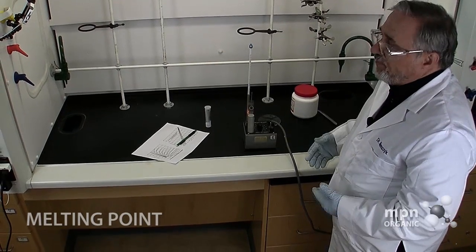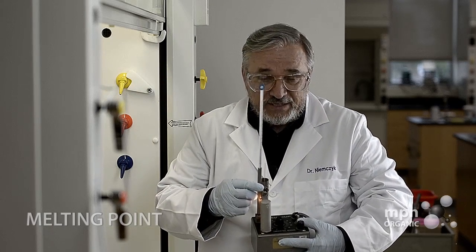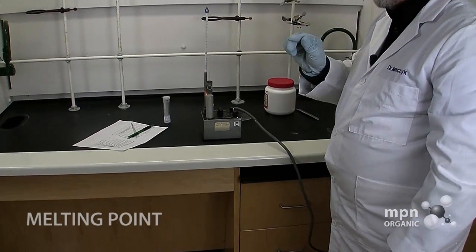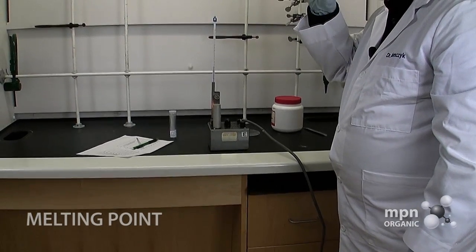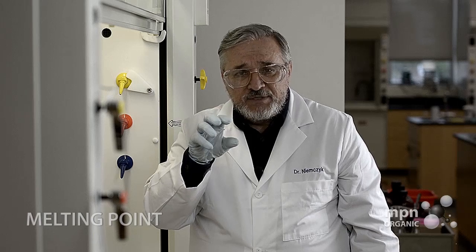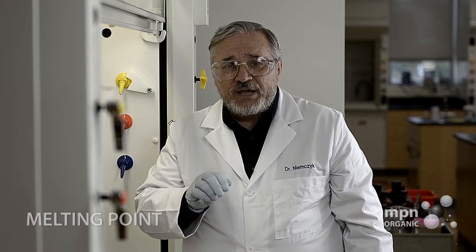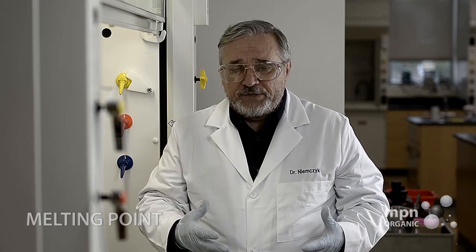Now, how do you know when a sample melts? Well, it's really very simple. You watch through the magnifying lens, right here. Watch through the magnifying lens, and you're going to notice that the sample, when it nears the melting point, will start to soften and sort of contract. That's very easy to see. When the sample is completely melted, that is called the melting point.